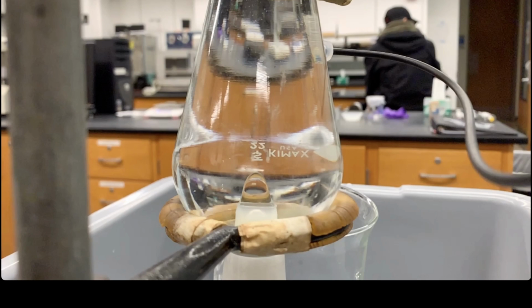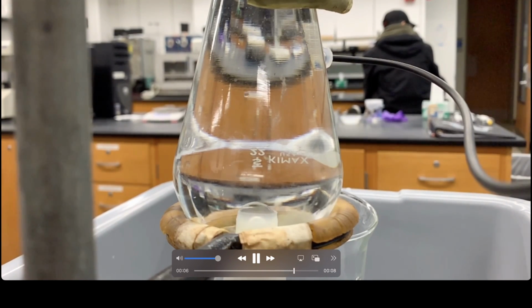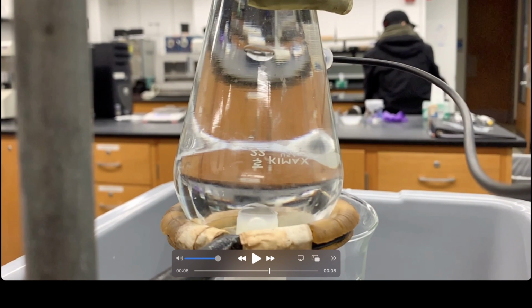Just to show you the experimental setup as well as the breakoff of the drop, here's a video of the experiment that I've done. The drop breaks up quite interestingly, where we see it almost vertical, and it breaks up, and we also see some satellite drops that form. So that's why we need the correction factor.